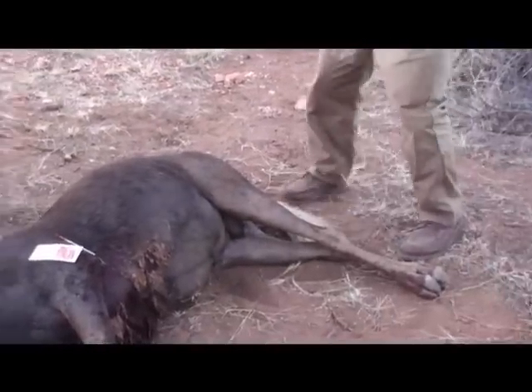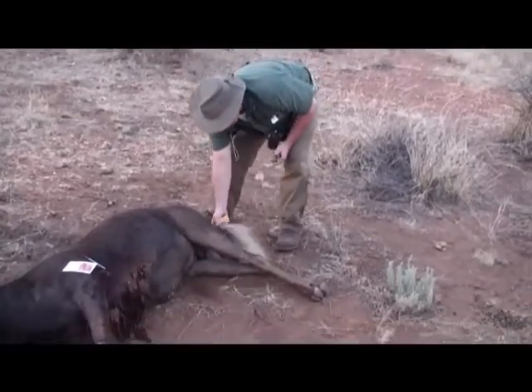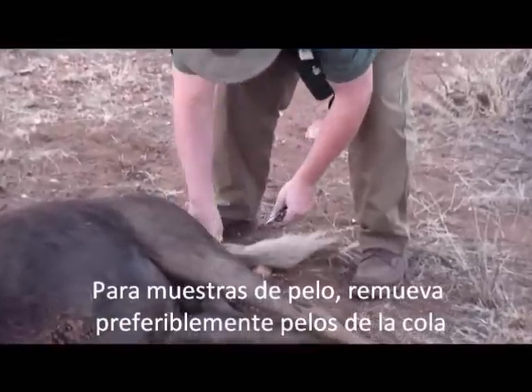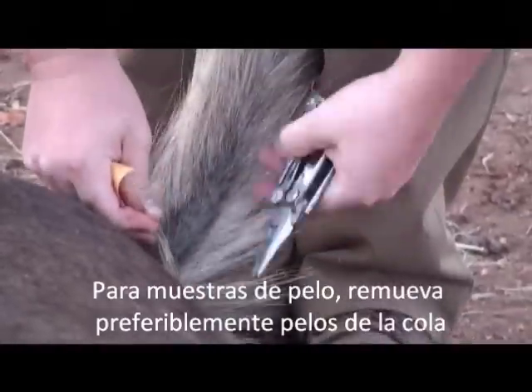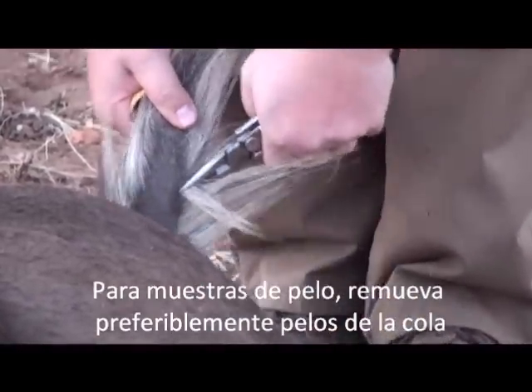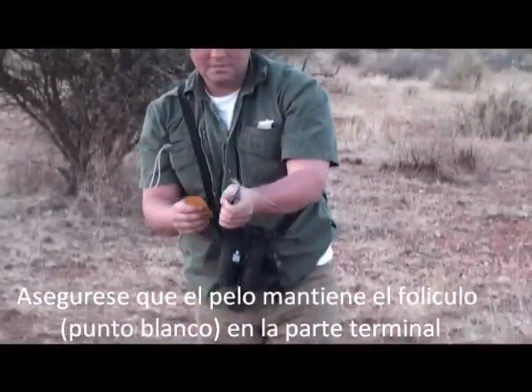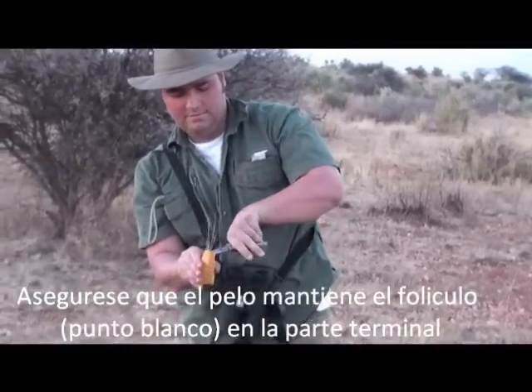We'll come back here to the tail — we always want to collect a hair sample as well. Get back here, grab some of those great tail hairs. Take our pliers and give them just a good yank, and on the ends of those hairs will be lots of follicles. We can just slip them right into a little envelope.